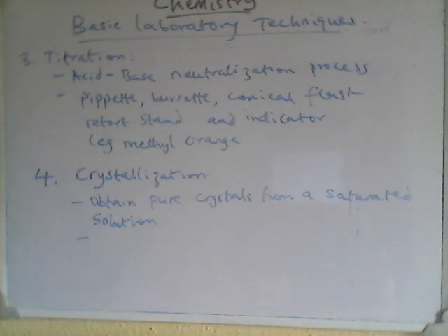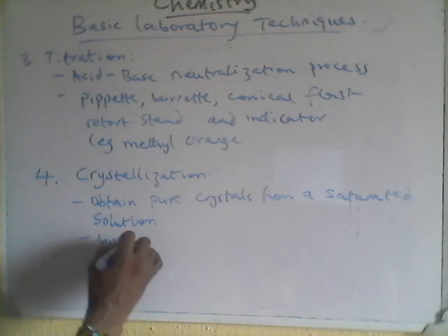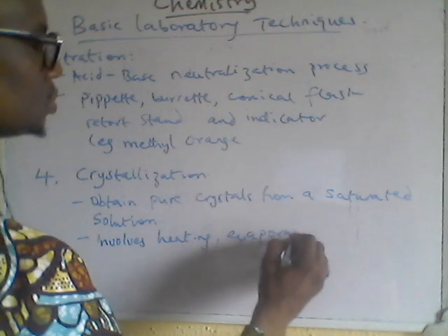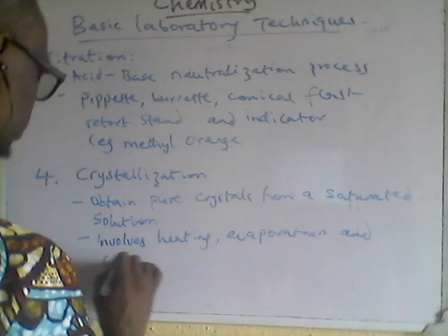It involves heating, evaporation, and cooling. So what does it entail? It involves heating, evaporation, and cooling.